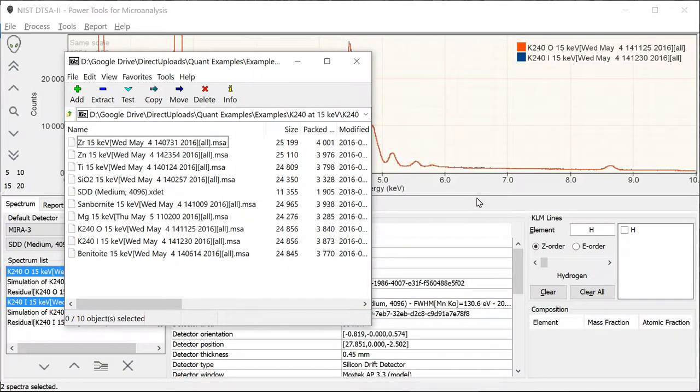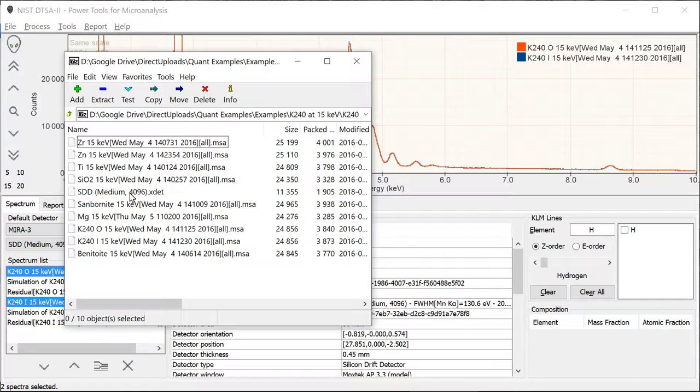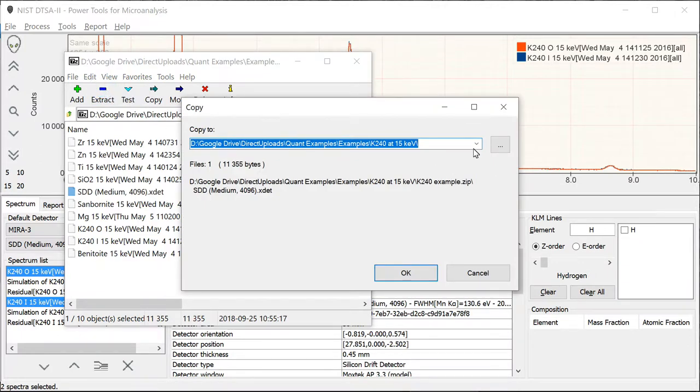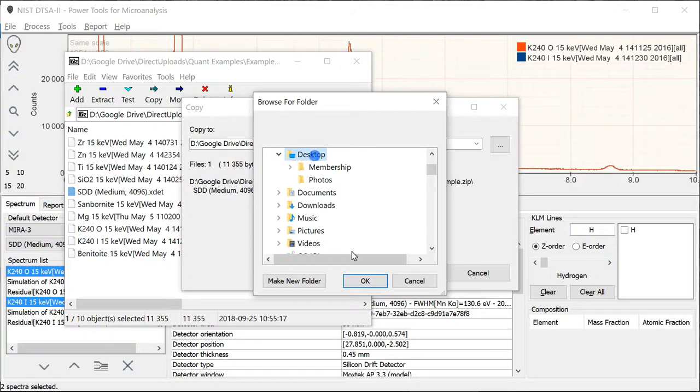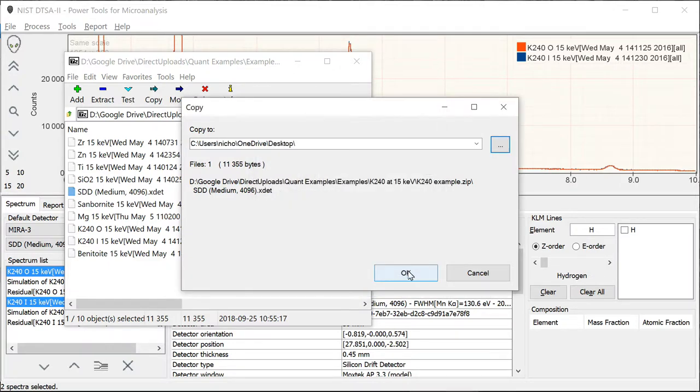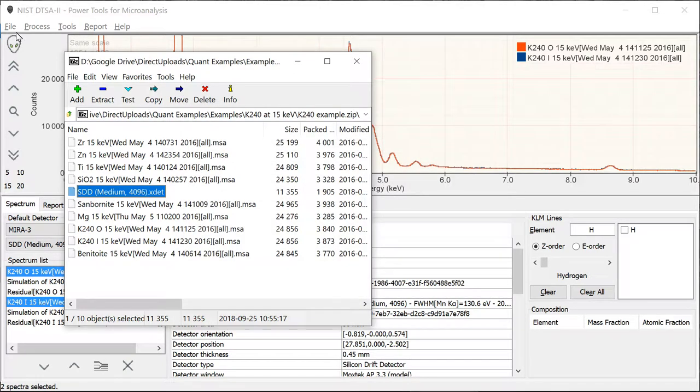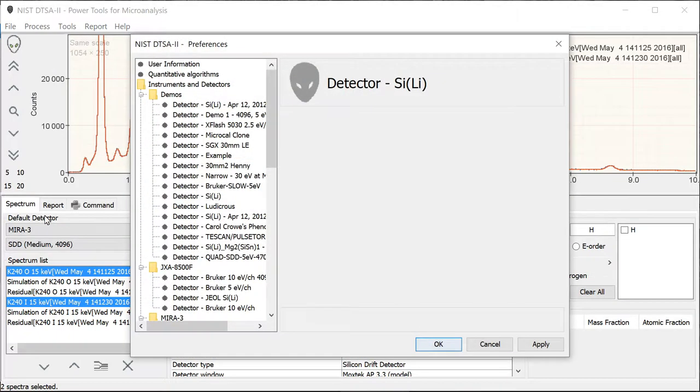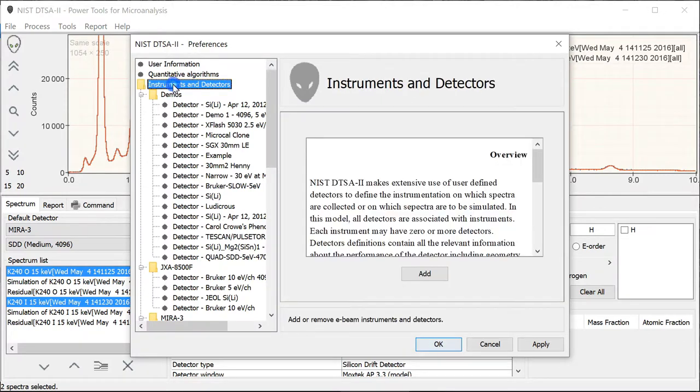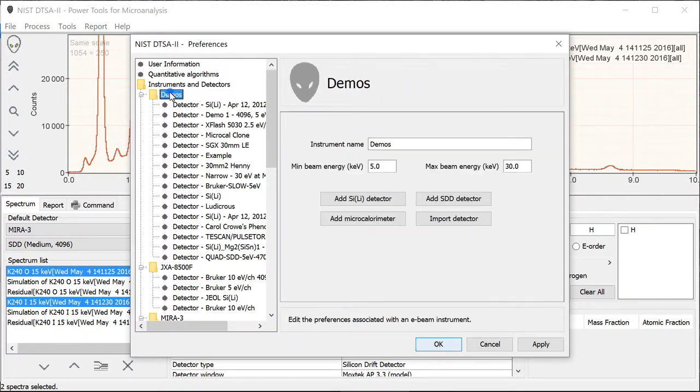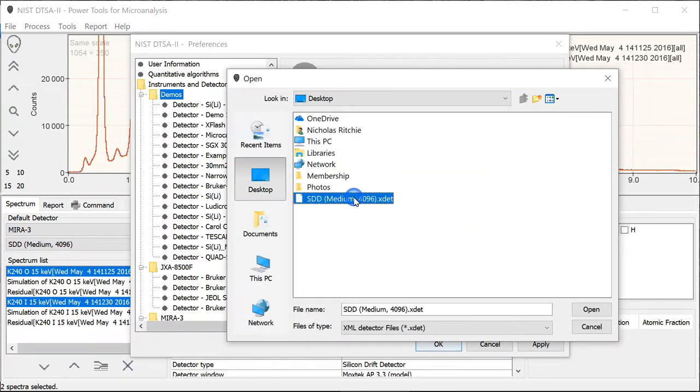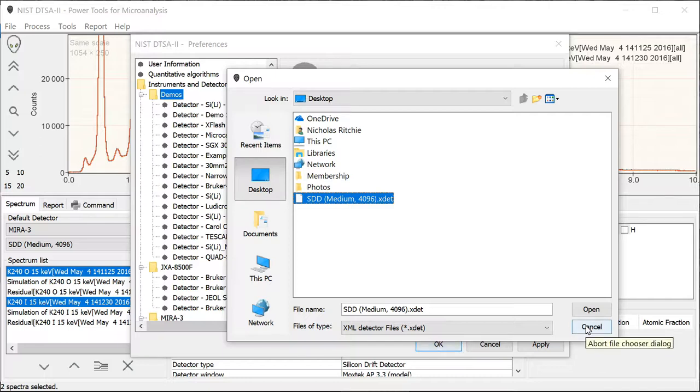So that you can follow along with the example, I've made available a zip file containing all the necessary spectra and one additional file, the detector definition. This detector definition you should probably extract somewhere convenient. We'll put it on my desktop. And then import using file preferences, and then instrument and detectors. And you get an instrument and import detector. Selecting that, going to your desktop and picking that, and then clicking open will import that into your detector definitions.